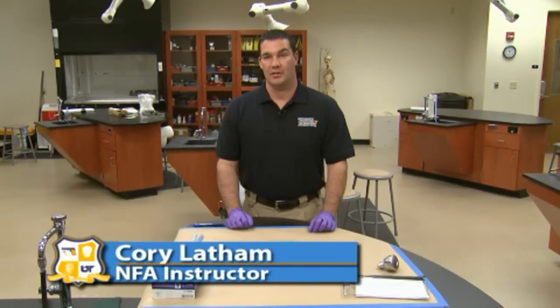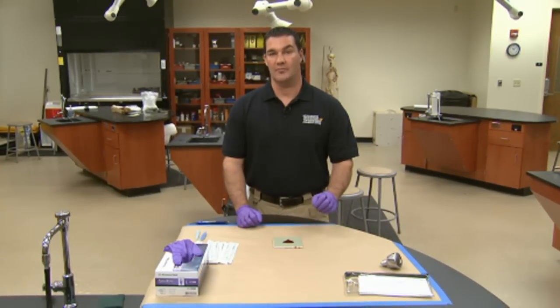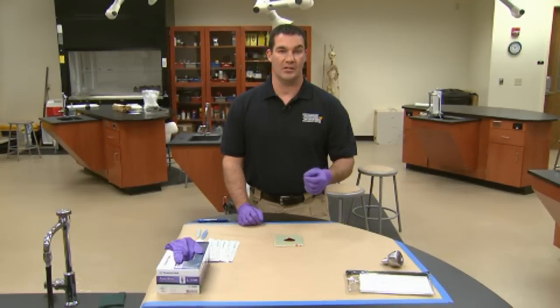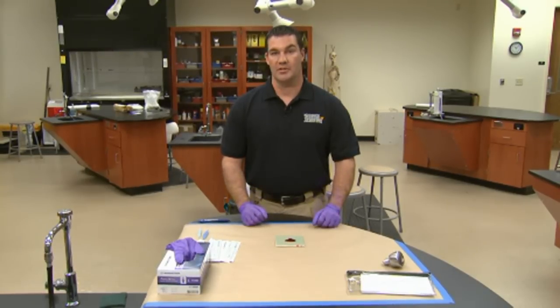Hello, we're here at the National Forensic Academy, and we're in the controlled environment of a laboratory, but we're going to demonstrate collection of biological evidence. Biological evidence could be semen, saliva, blood, or other bodily fluids. For demonstration purposes today, we're going to discuss the collection of blood.